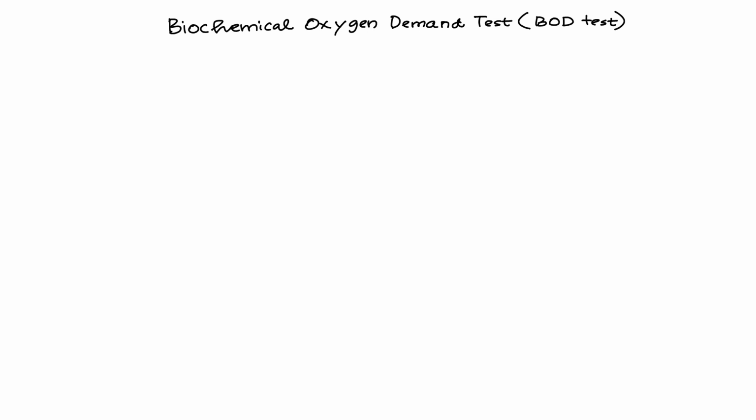So today I'm going to discuss the biochemical oxygen demand test, or BOD test. The idea of the BOD test is understanding how bacteria or living organisms in the water can consume oxygen in order to, of course, consume organic matter or any other matter that is going to demand oxygen. When the bacteria eat that, they are going to demand oxygen. So we are going to determine how much is there and how fast they are responding. So the quantity, I'm looking at quantity and rate.